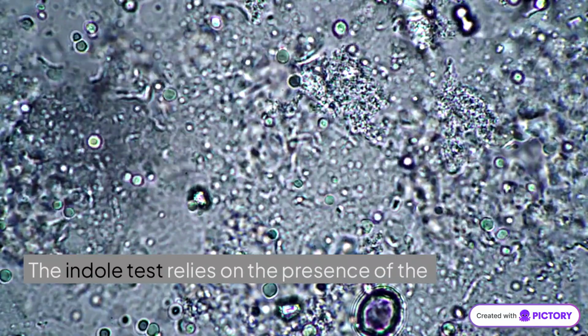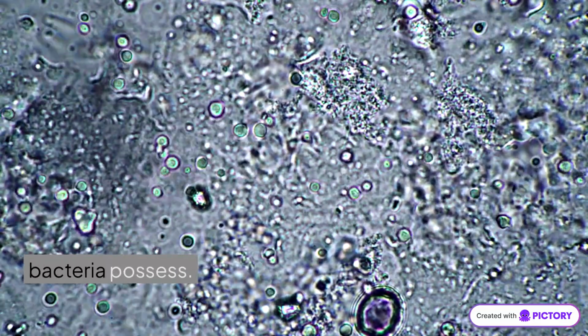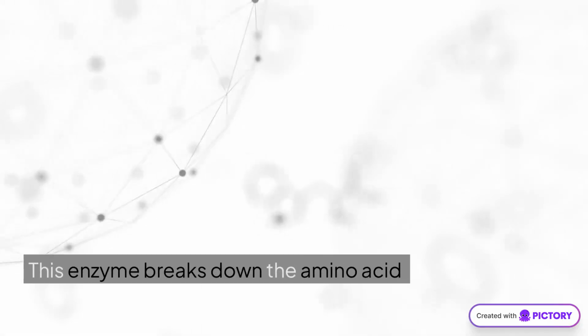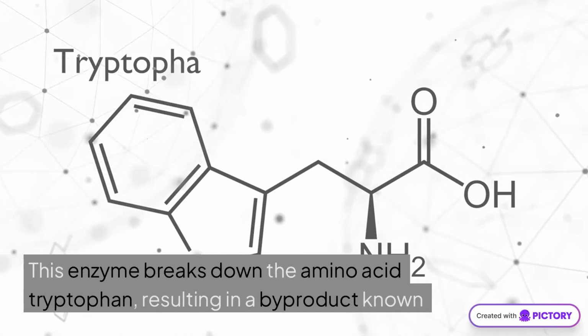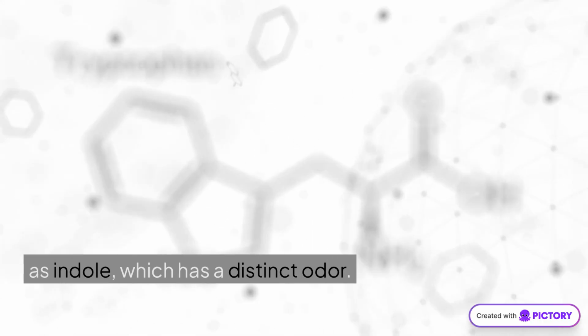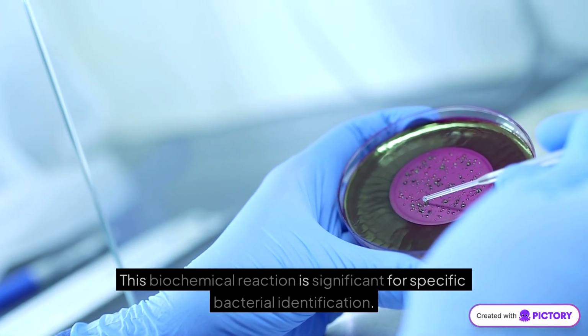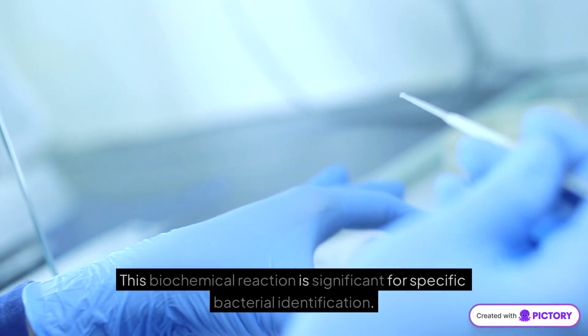The indole test relies on the presence of the enzyme tryptophanase, which some bacteria possess. This enzyme breaks down the amino acid tryptophan, resulting in a byproduct known as indole, which has a distinct odor. This biochemical reaction is significant for specific bacterial identification.